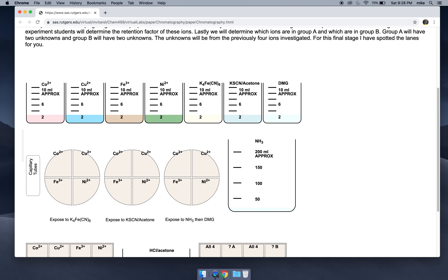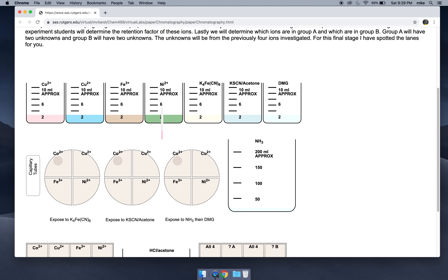So you get a capillary tube. Let's get our first ion — cobalt 2+. We click and we got a little pink in our capillary tube. We'll spot our three pieces of paper with the cobalt, near the cobalt name. Now in the lab, you don't take the same capillary tube and put it into a different container — that would contaminate the container. So each time you get a new capillary tube.